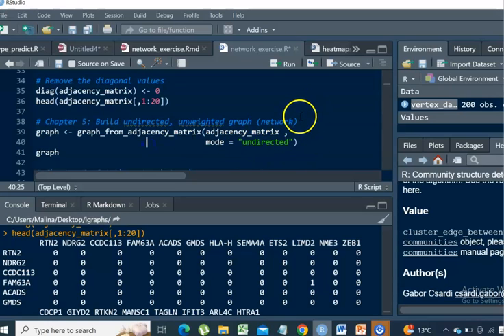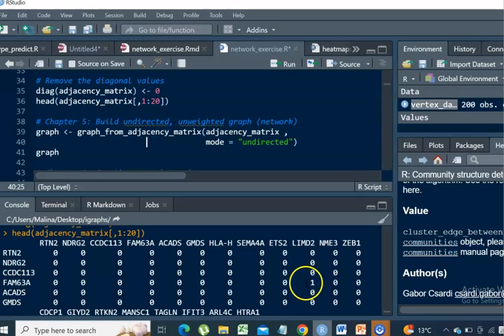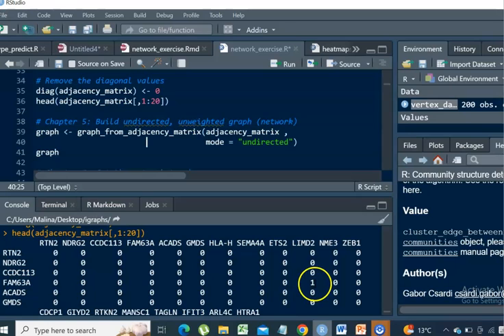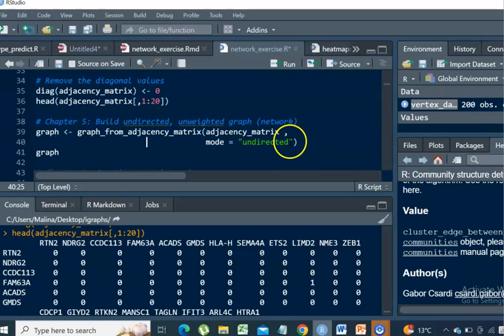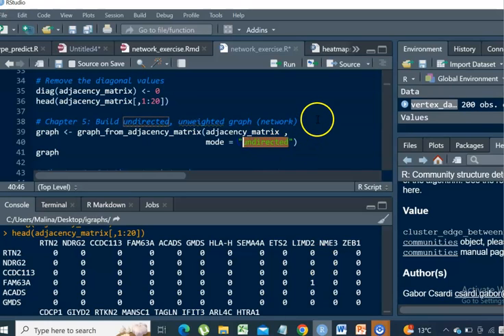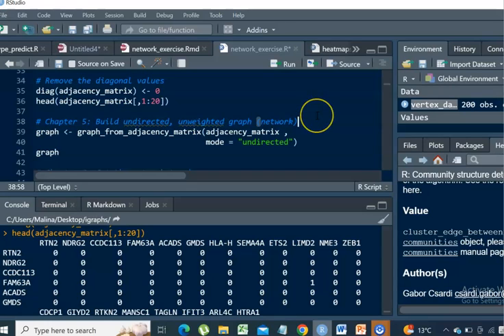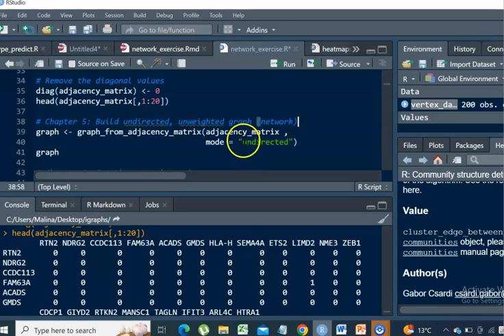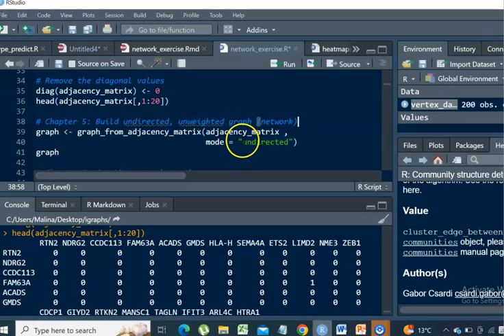What we are going to create now, because we did not consider the weight of the edges or just their presence or absence, is going to be an unweighted interaction network. And it is also undirected because we do not know with our correlation analysis whether there is a directional effect in the correlations. So that's why our graph that we are going to generate is also going to be undirected and unweighted.